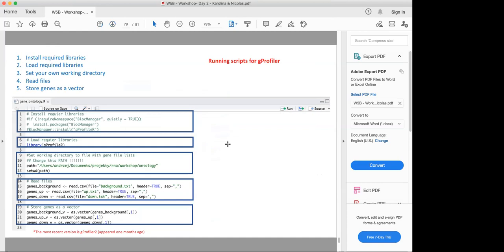But let's try also to do the exercise with the coding. And actually the gProfiler coding also has, I checked now, the possibility of doing some visualization. Before, you could just get the GO terms for the upregulated genes and separately for the downregulated, but it didn't give you the possibility of creating any heat maps and visualization.